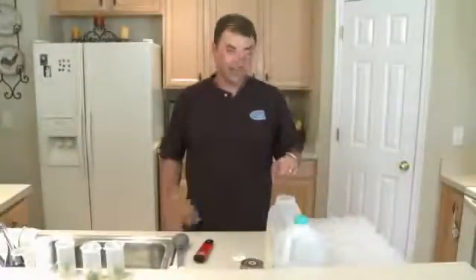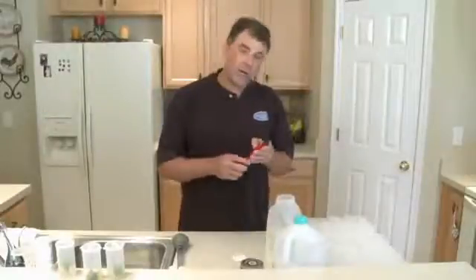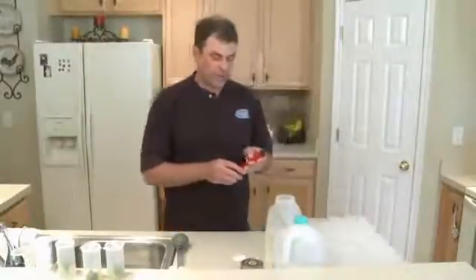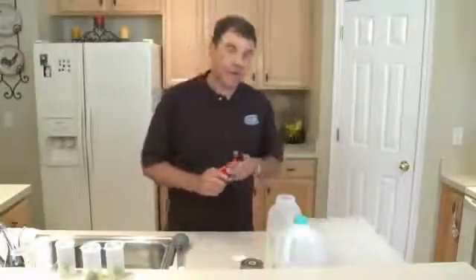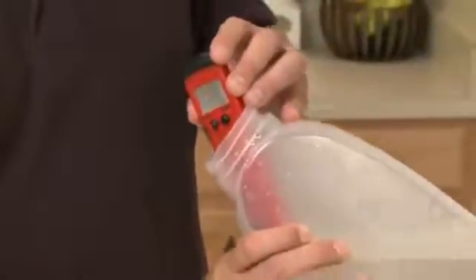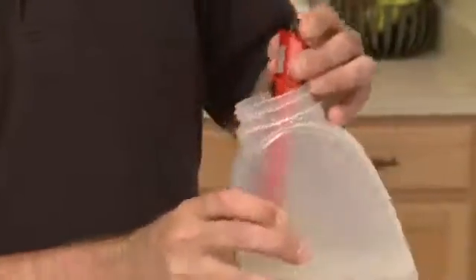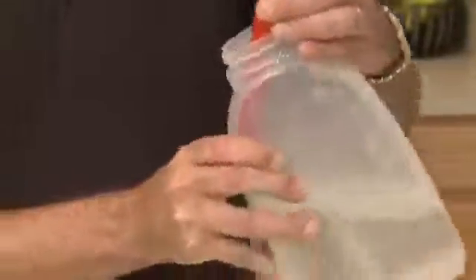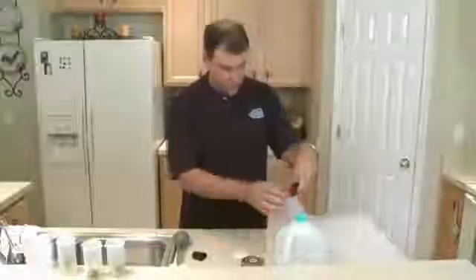We've got everything in the tub and the pH meter — this has already been calibrated, by the way. I'm going to turn it on to measure our solution before adding the gel. I'll switch it around in there. I'm reading 6.1, so I'm going to correct that.